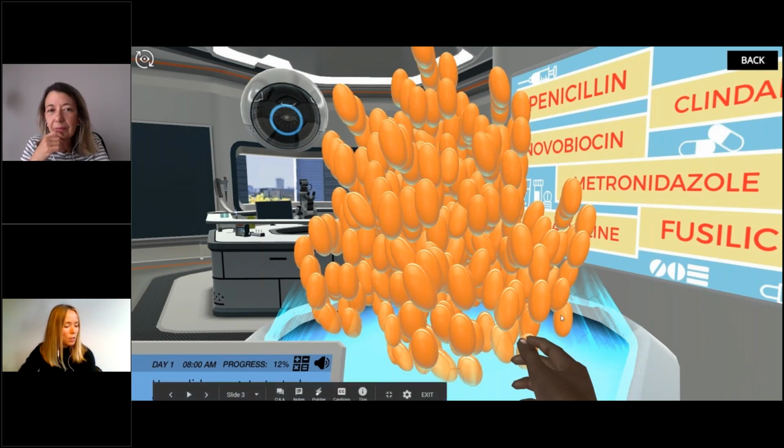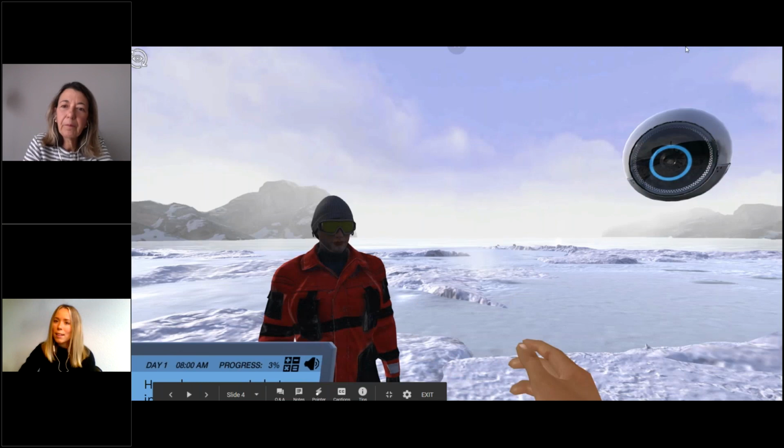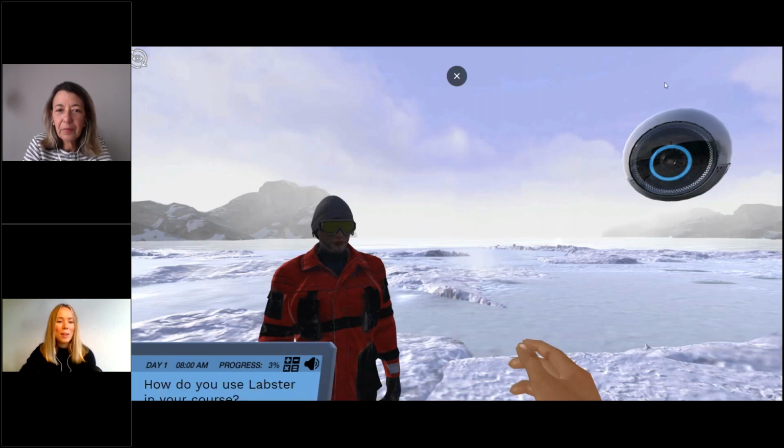So, let's move on to the next question here, which is, again, I'm sorry if it's cut off at the bottom there: how do you use Labster in your course? Tell us a little bit about that. Yeah, so this was a pilot, so we haven't done the fully online lab yet. And in the pilot, what we decided is to use the simulation as a pre-lab. So we matched the virtual labs to labs that we would be doing in the lab, and then gave them as an assignment, as homework for the students to do.